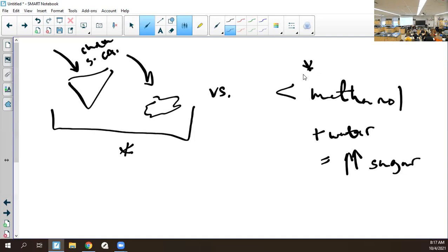I just saw another one that's really, really good. What if we didn't wait for the sugar and water to dry? When we take the mass of our weigh boat containing the sugar, what happens if we still have water in it? We're weighing the water too, so we would have a lot more pretend sugar, because we're weighing the water as if it's sugar as well.